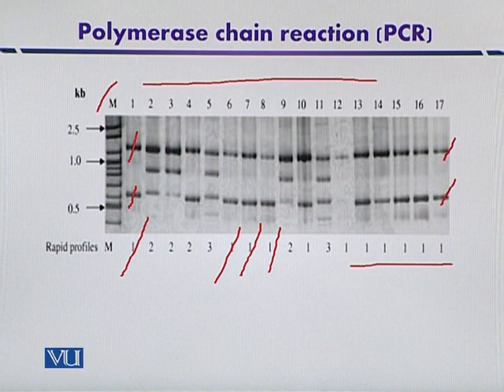So we can say that these 2 bands belong to the same species. Here different lanes indicate that they belong to mainly the same strain or microbial species. In the same way, number 2 belongs to the same microbial species. And similar is the case with the third strain, which indicates the presence of 3 bands at different locations.